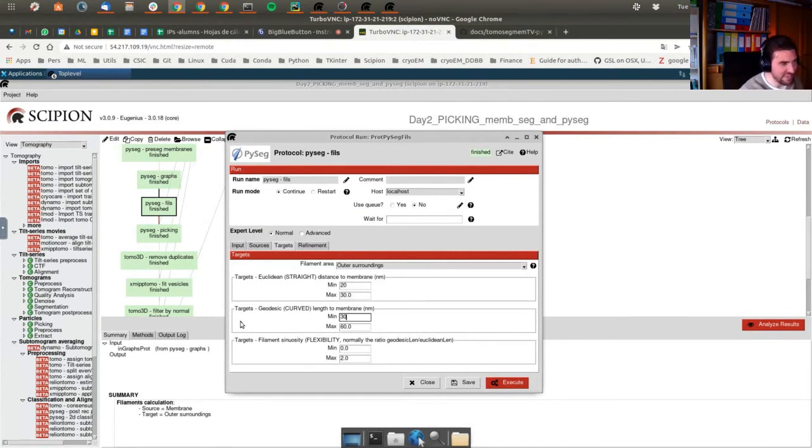I can go from the highest, for example, straight to the highest considering curved.